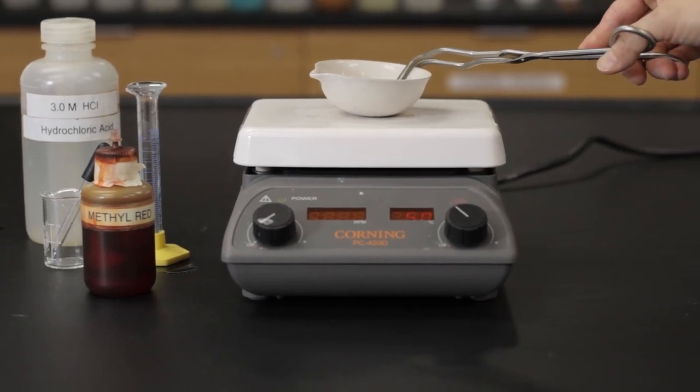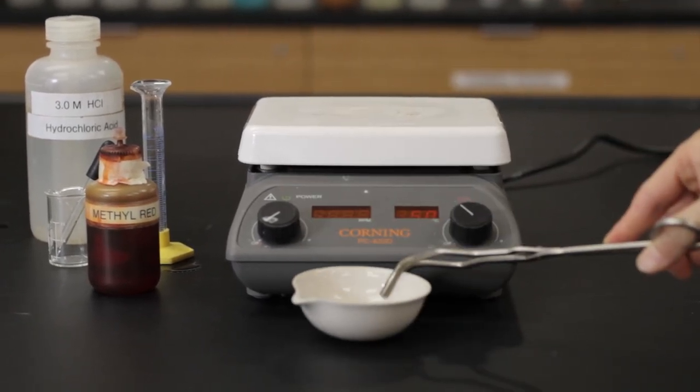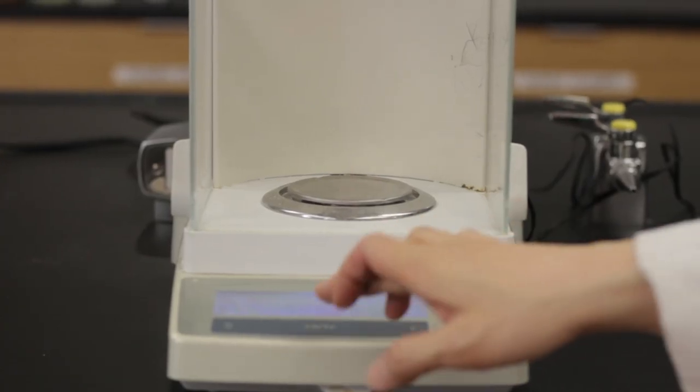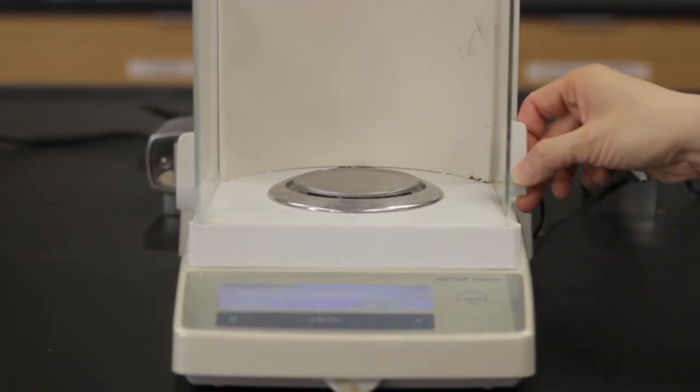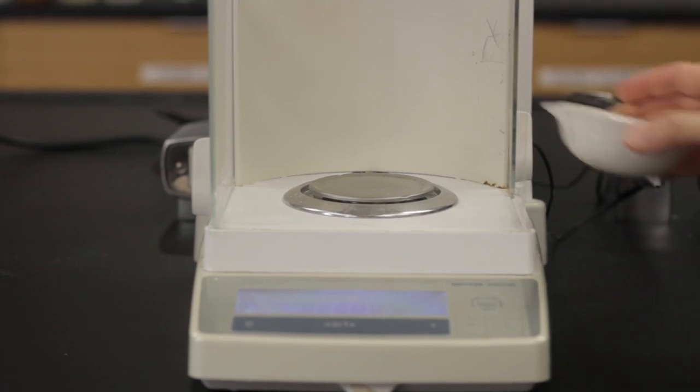Remove the evaporating dish off the hot plate using crucible tongs and allow it to cool to room temperature. Reweigh the evaporating dish and record the exact mass.